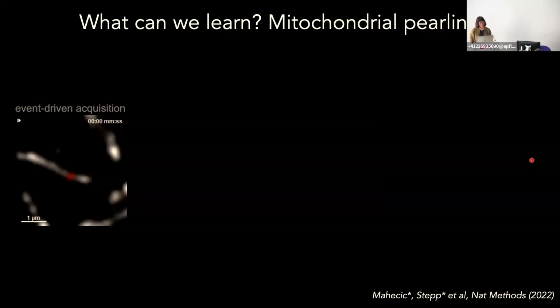In fact, these event-driven acquisitions gave us a key insight into some part of the mitochondrial life cycle, which was previously obscure to us. So I've mentioned the fact that mitochondria need to divide, to proliferate, and I've mentioned that they have their own DNA copies.